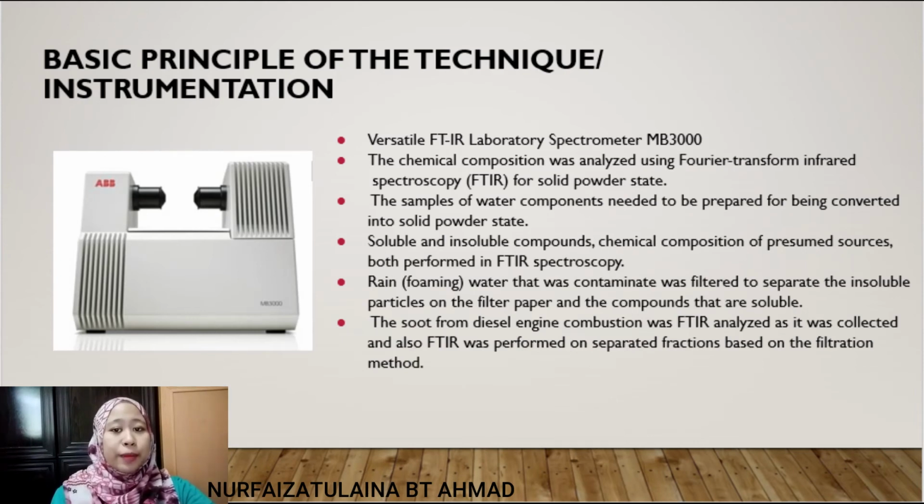So next is the basic principle of the technique using FTIR. The apparatus used is a versatile FTIR laboratory spectrometer, the MB3000. The samples of water components and the soot needed to be prepared by being converted into solid powder.